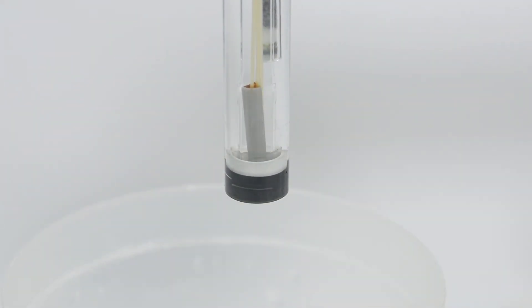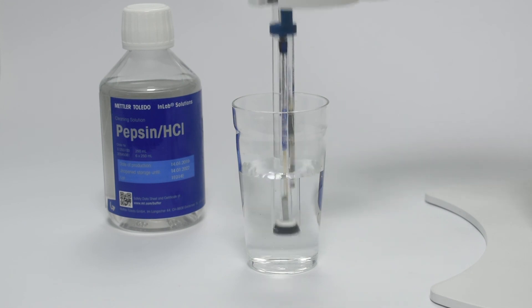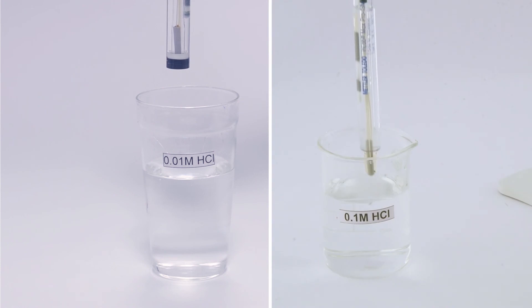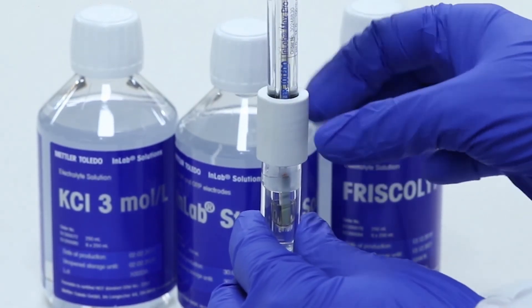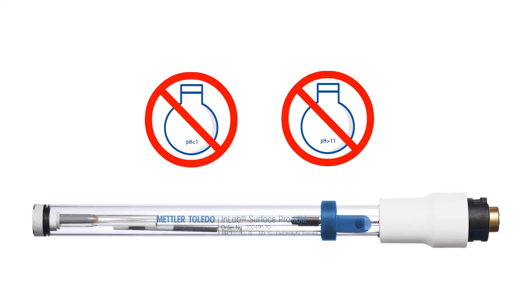Soak the electrode in pepsin HCl solution for one hour once a week to remove protein buildup on the glass membrane, as regular maintenance improves the life of the electrode. Periodic reconditioning of the electrode is recommended. Store the electrode in InLab storage solution when not in use. The pH range for the InLab Surface Pro ISM is 1 to 11 pH units; it should not be exposed to harsh acidic or alkaline chemicals.